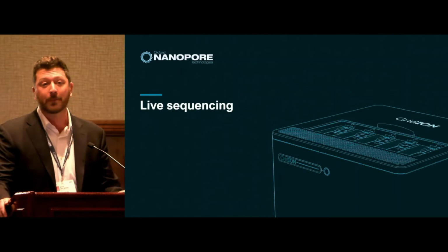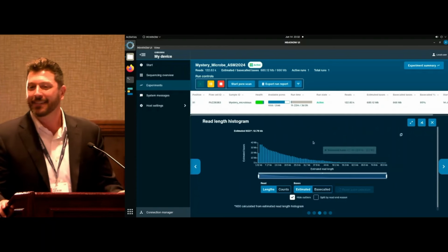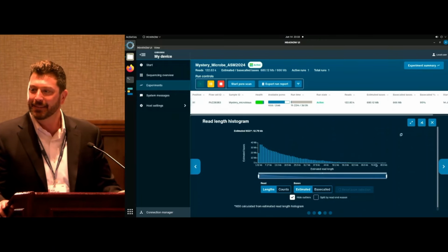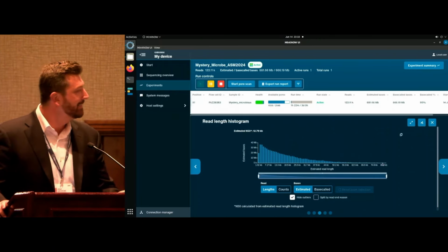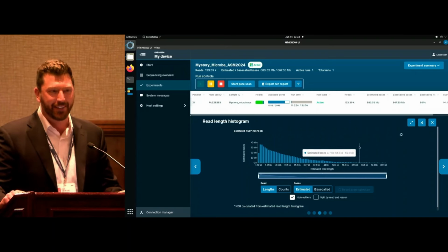Over to you, Carly. So we're at 122,000 reads now, still sequencing, and our N50, which is our median read length, is about 12.8 kb. But I would like to point out that we are getting really long reads, so we have a long read of about 80 kb. So our next hint, hint 3, it is a plant pathogen. Hint 4, it is transmitted by insects. Back to you.